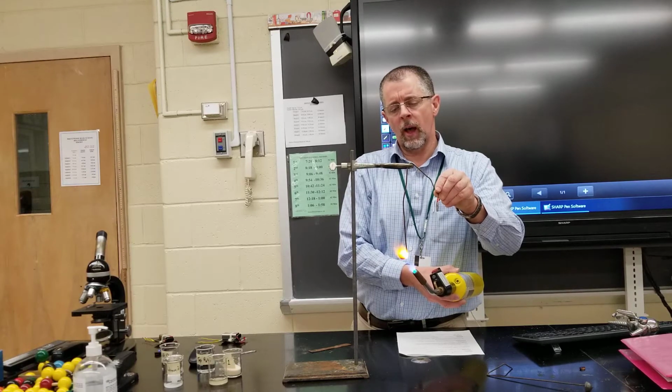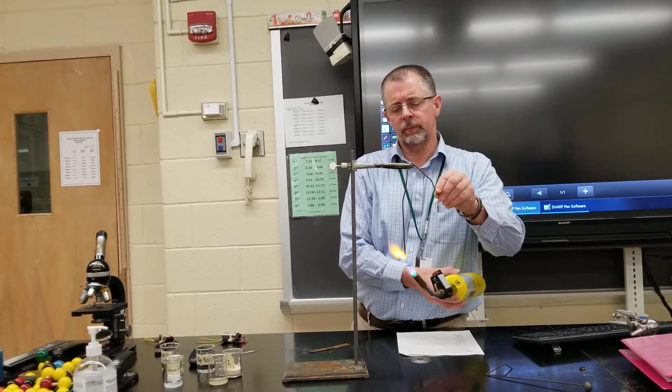It's requiring a lot more heating to get it to melt. And as you can see, the metal is actually getting very, very hot. It's turning red. And it's starting to melt now.